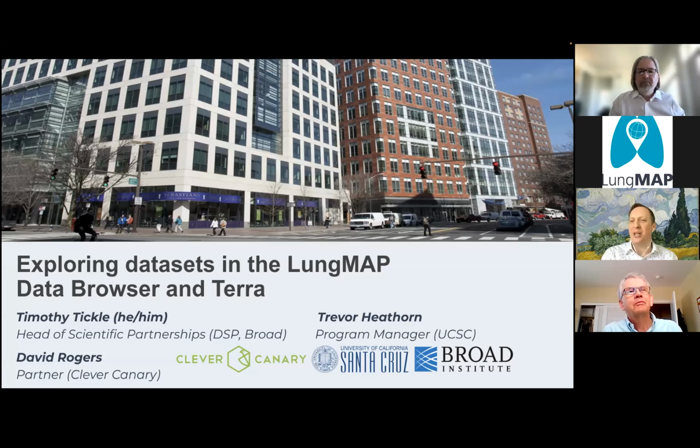So I appreciate everyone's time today. We're gonna have sort of a relaxed, fun journey through some of the stuff that we've been putting together and talking a little bit about exploring data sets in the LungMAP data browser and in Terra, and talk a little bit about what Terra and the browser are and what the motivations are around them. We're not gonna be able to cover everything. These are complex applications, but I'm hoping to give you a spirit of why they exist and how to use them a little bit. And if this is exciting for people, we can continue doing this.